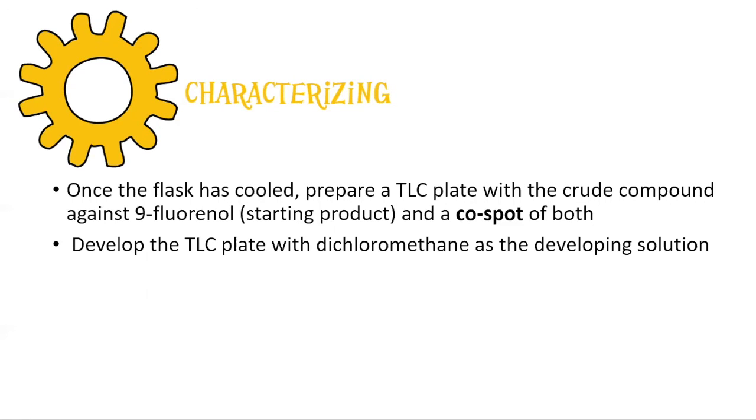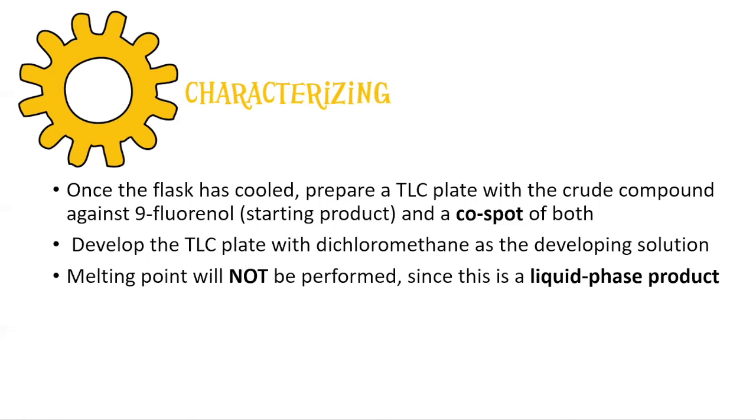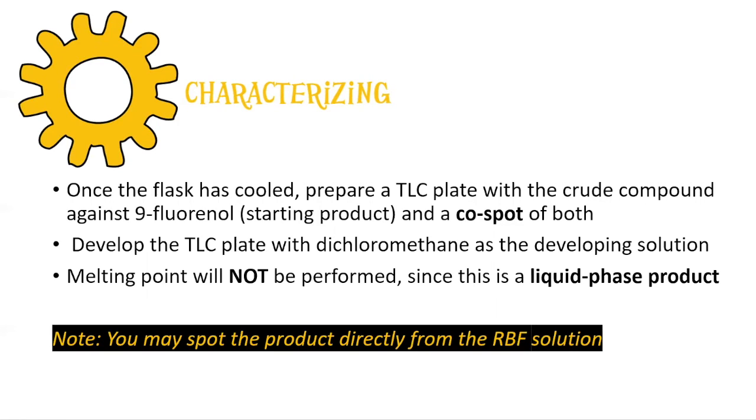You'll then develop the TLC plate with dichloromethane as the developing solution. And we will not perform melting point, as this is a liquid phase product. You may spot the product directly from the round bottom solution.